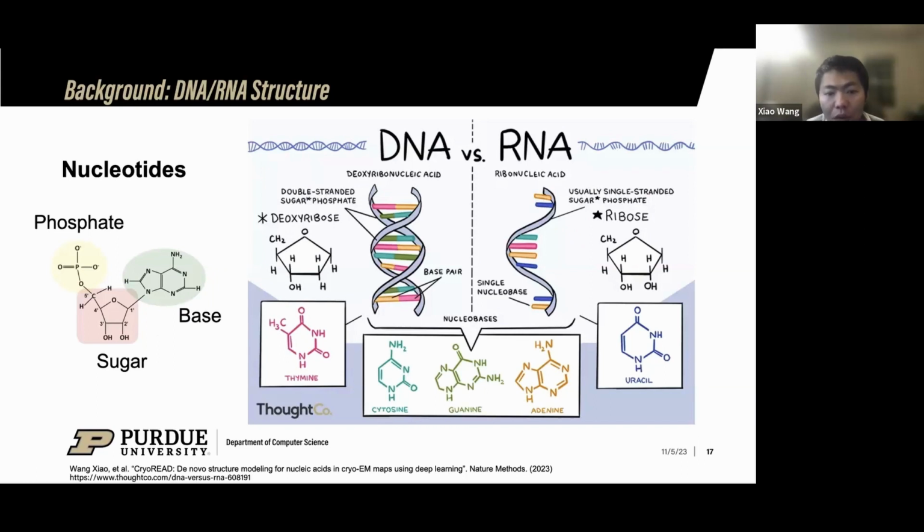There are very minor oxygen differences in the sugar regions, and they share three of the same base types, where thymine and uracil differ across DNA and RNA. Well, there are only very minor differences of the carbon in the left top bottom region.